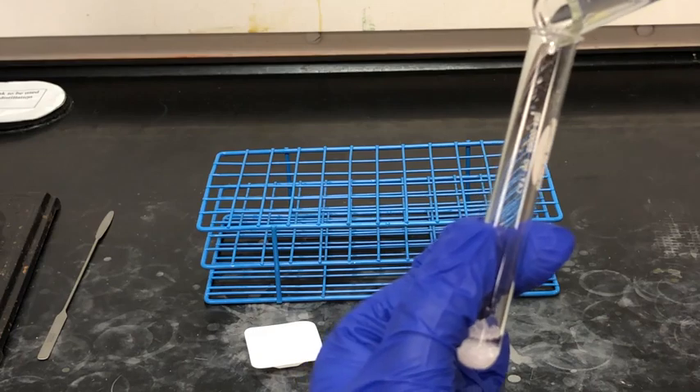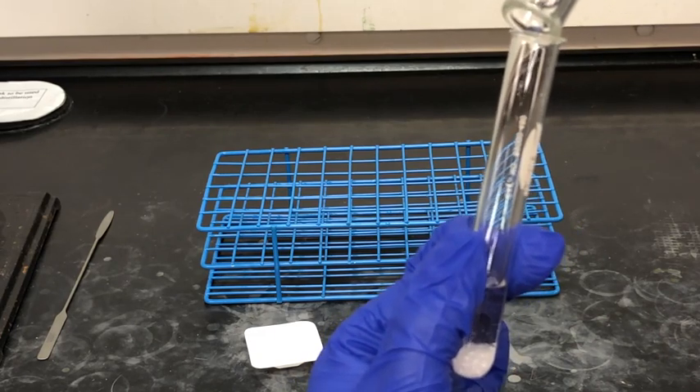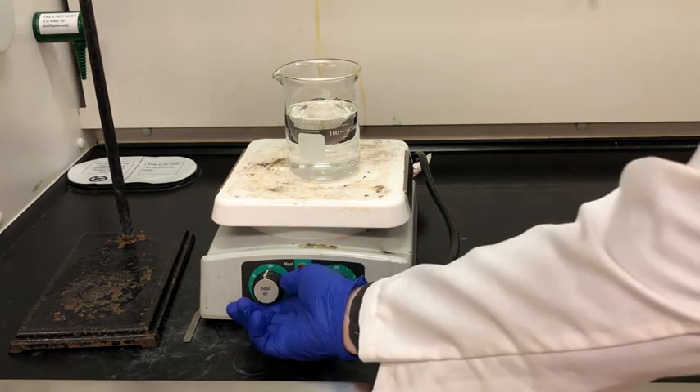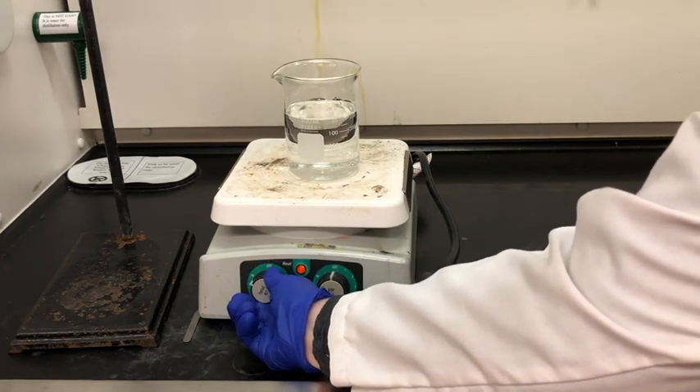Now we're transferring that 2.5 milliliters of water into our test tube that contains our impure aspirin sample. In the next step we need to boil our sample, so we're going to set up a large beaker of water on top of a hot plate and turn on the heat setting so that it eventually will boil.